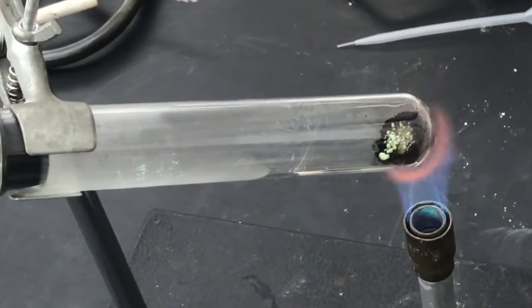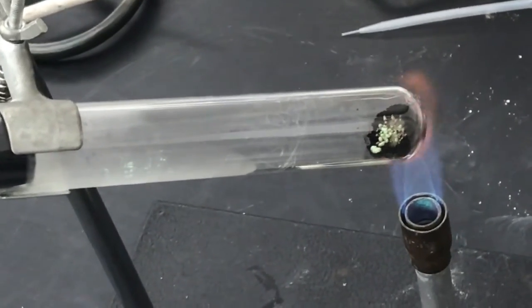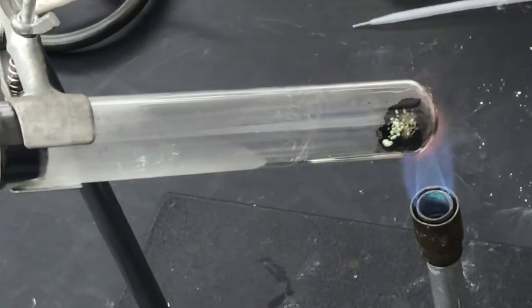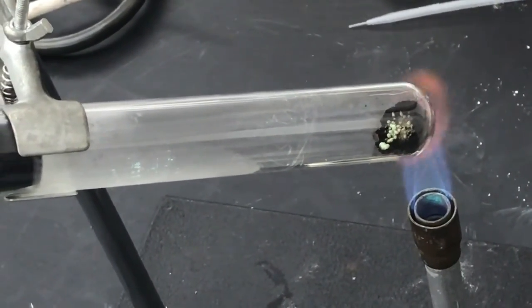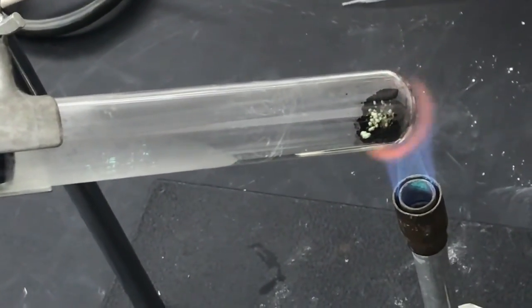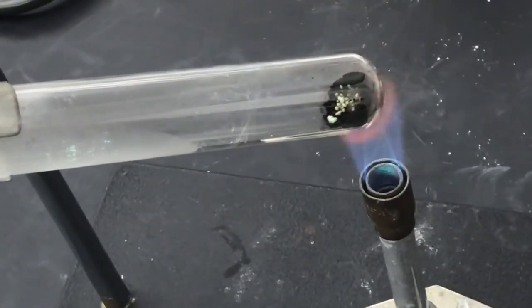So I want you to think that if I add heat to copper 2 carbonate, and I know that carbon dioxide gas came off of it, what might be left behind that might look like that? Again, it doesn't look like copper, but it's going to have some copper in it, right? Remember, all the products have to be made up of the same things that the reactants contained.